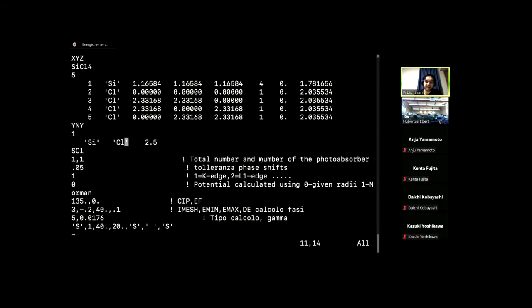Another flag that you can use here is asterisk, and in this case it means any kind of atom, not a specific element. In this case, it will not make much difference.